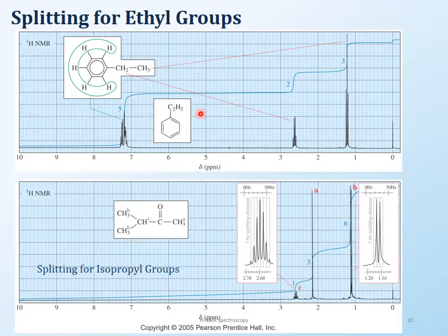All right, and then the benzene protons are going to come as a mess, and this is called a multiplet. The multiplet here indicates that there is no clear pattern, because these 5 protons can be aligned in very different ways in the magnetic field, but there is no clear proportion to it, and that's why you end up getting a multiplet.